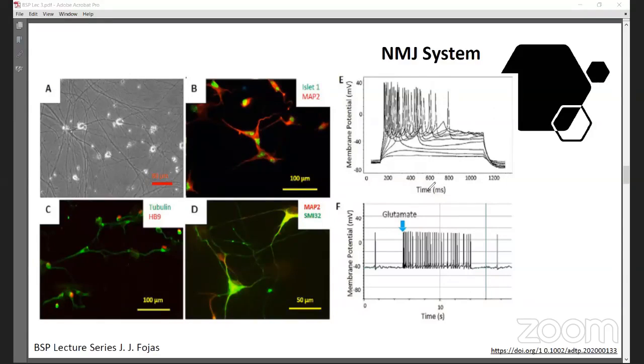And then they tried to use glutamate. So this is F, your image F. That's application of glutamate to the patched neurons, which, as you will know, could elicit active firings, confirming their responsiveness to glutamate.